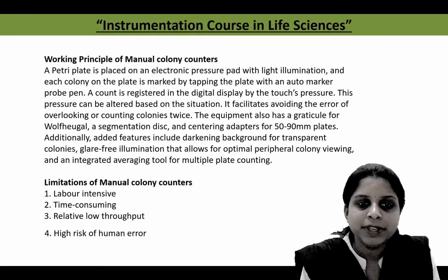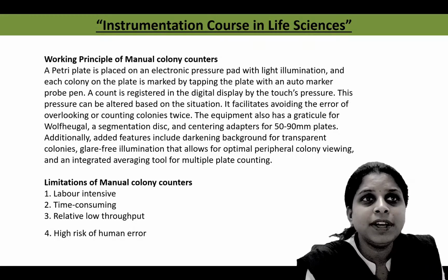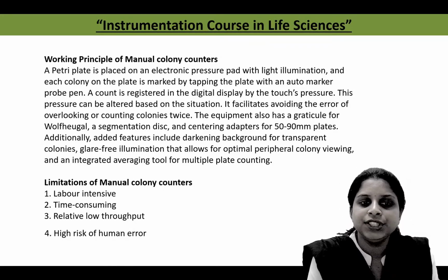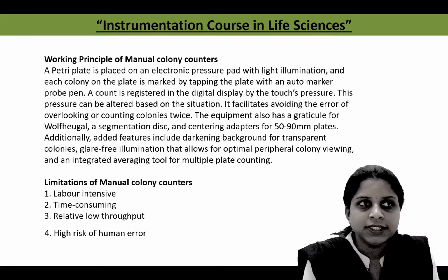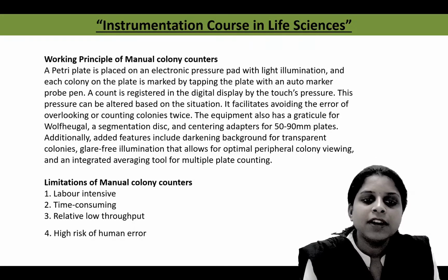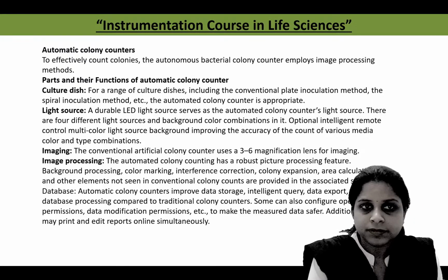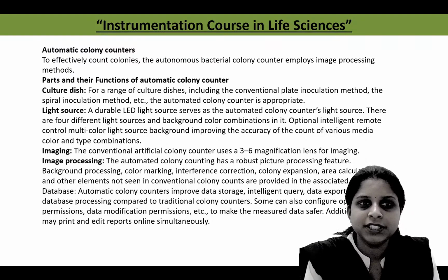But there are some limitations while using a manual colony counter. It is labor intensive, meaning it requires a technician to count the colonies. It is time consuming, gives relatively low throughput and has a high risk of human error. So to overcome these limitations, scientists developed automatic colony counters to effectively count the colonies.